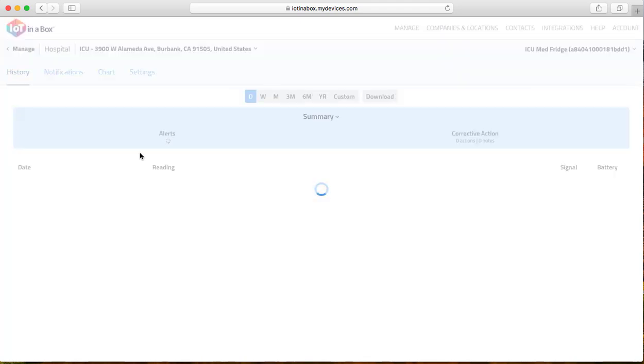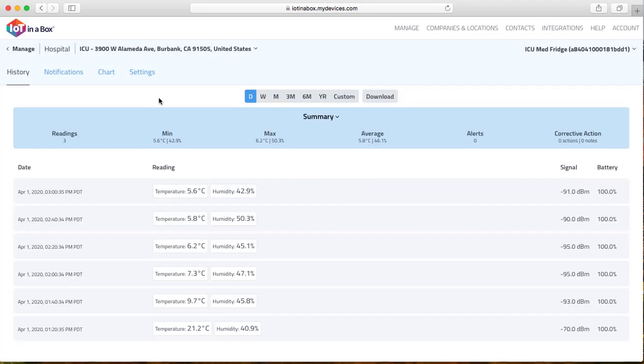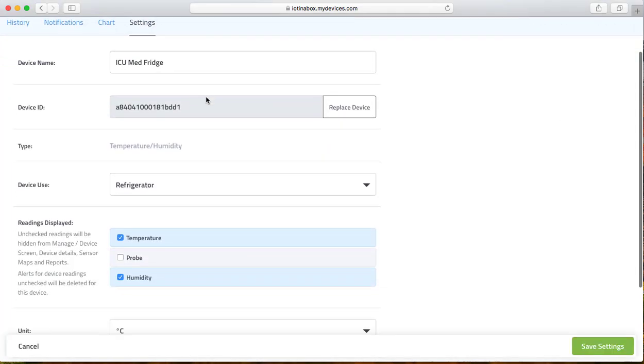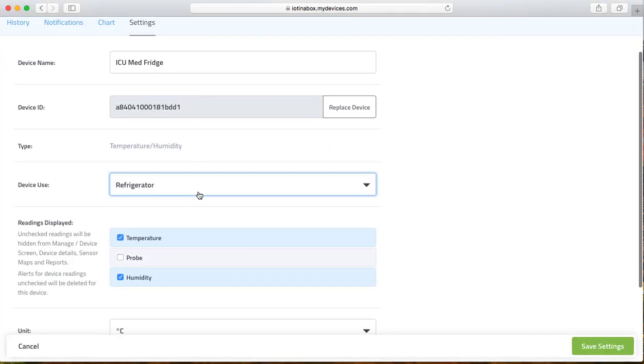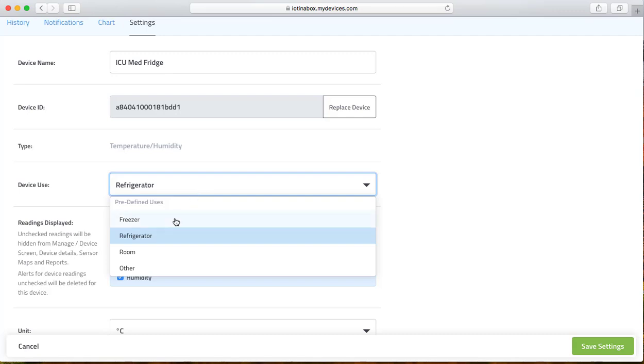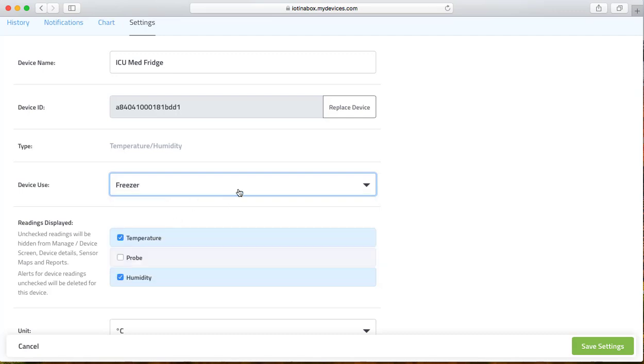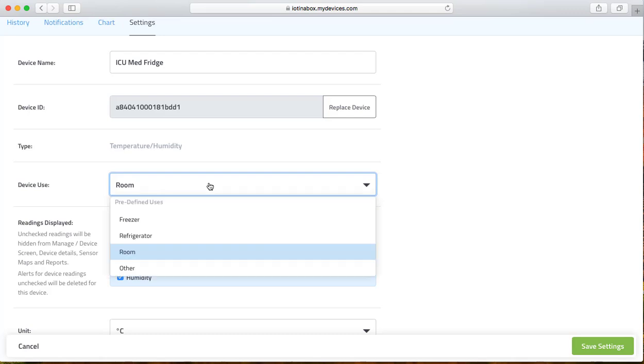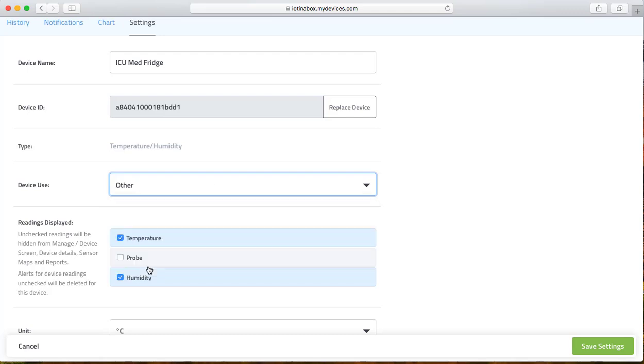Clicking on that device, going to settings, and then under device use, we'll be able to switch it to freezer, or room for ambient temperature, or if you're monitoring warmers in hospitals, you'll be able to switch it to other as well.